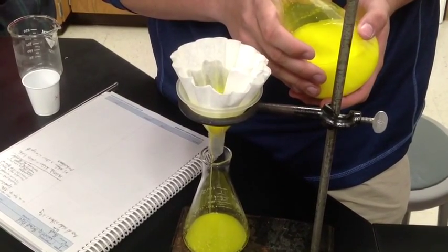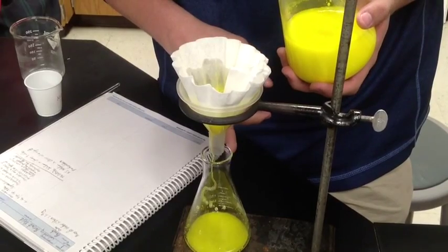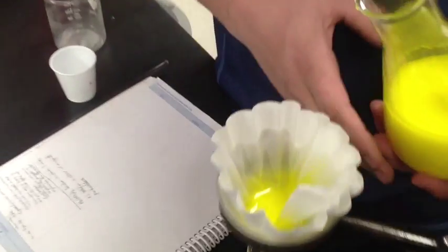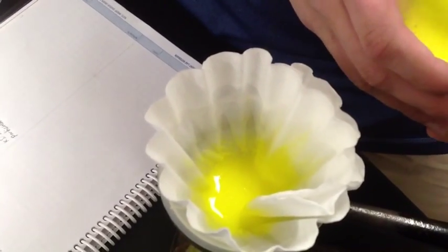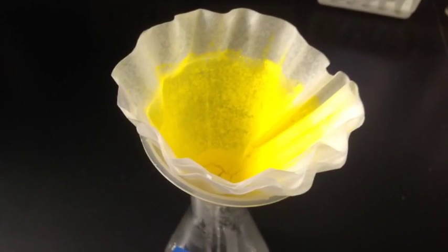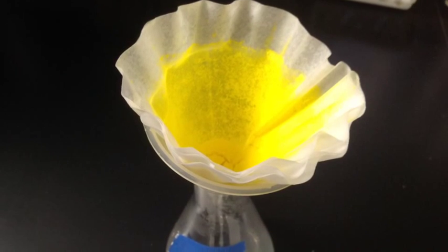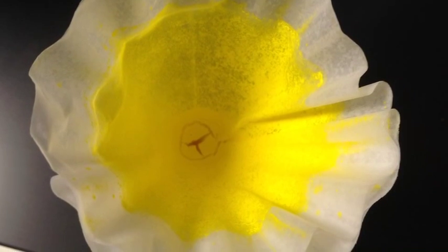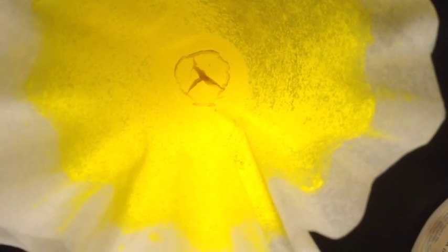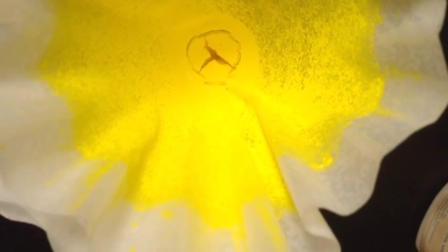We will take the lead iodide which we are collecting in the filter paper, and as we see here the filtrate is forming. We will then dry that filter paper over a 48 hour period. At the end of 48 hours we will weigh it, gather our actual yield of lead iodide, and compare it to the theoretical yield we calculated.